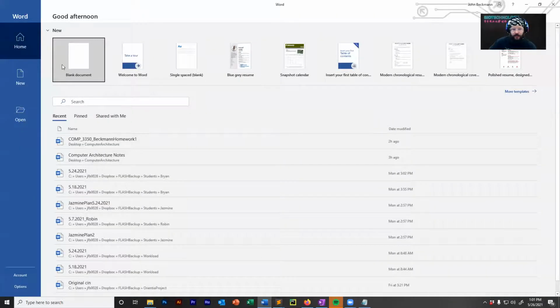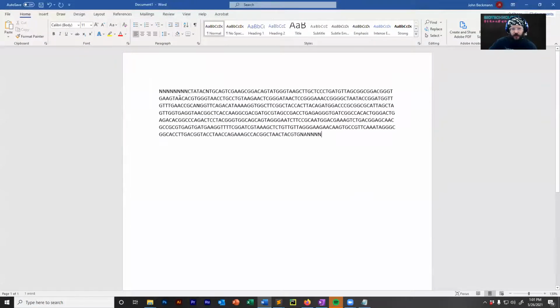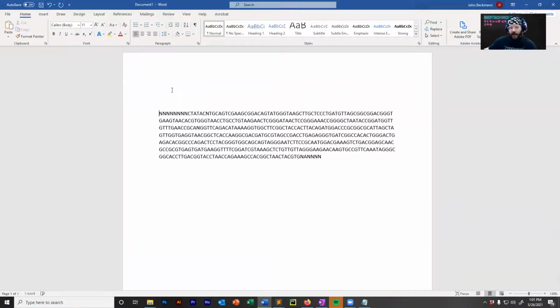And this is what I'm going to encourage you to do. I analyze all my Sanger data in Word. There are programs to analyze your Sanger data. Some people are going to think I'm old-fashioned. There are complex programs. The reason I like to do it in Word, and the reason I encourage students to do it in Word, is because it actually contributes to learning how to read and write DNA.